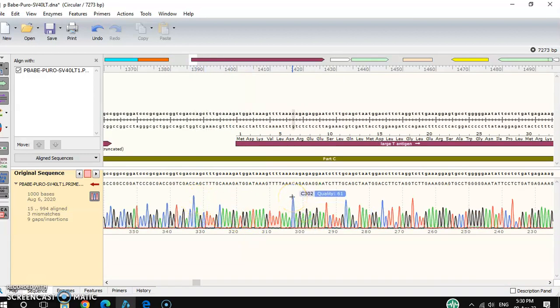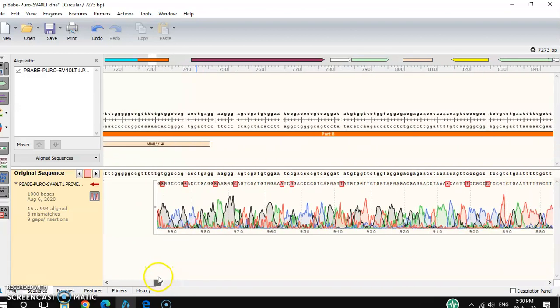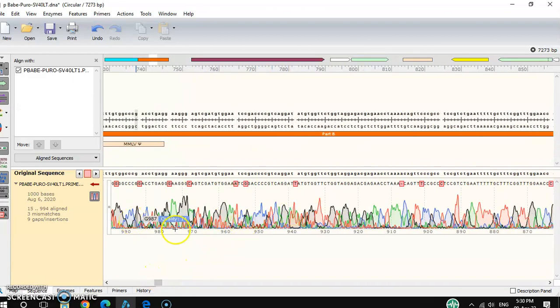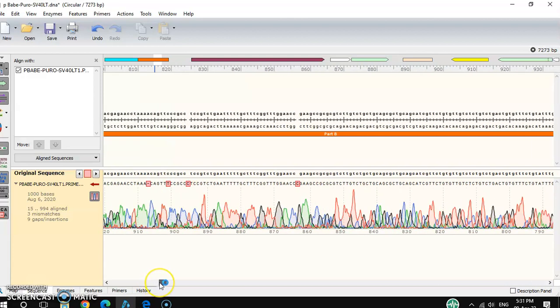However, if you see overlapping peaks — where your peaks are overlapping with other peaks — it means the sequencing result is not good in that part, and you cannot rely on the result in that region.